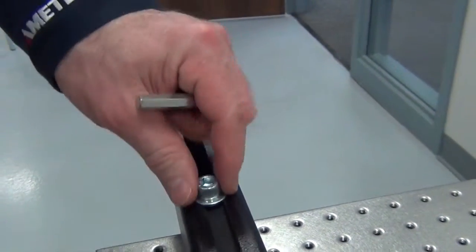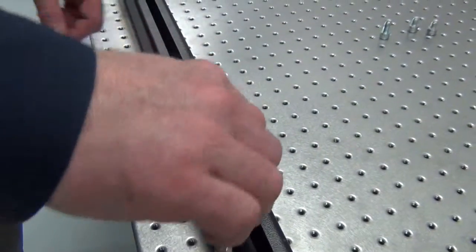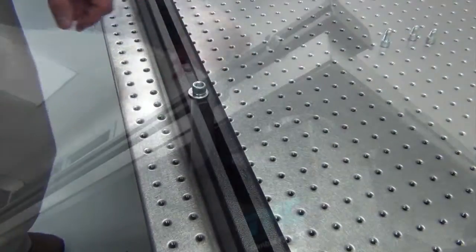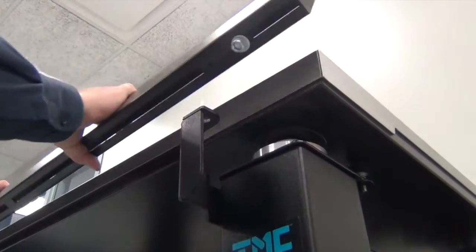On the underside of the front support bar, loosen and slide the two bolts. Position the front support bar on the brackets. Insert the two long bolts on both ends.